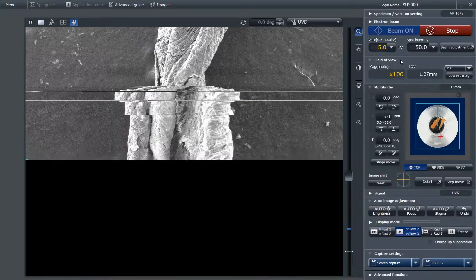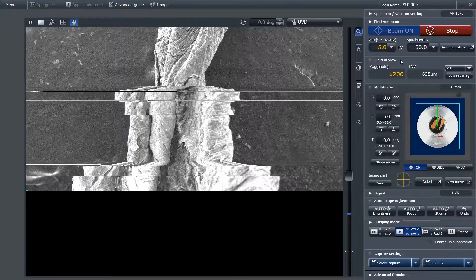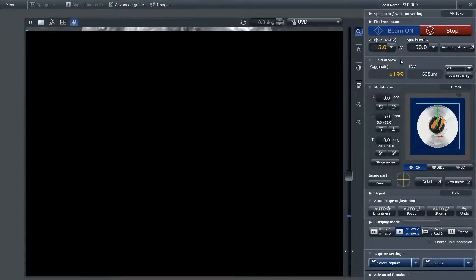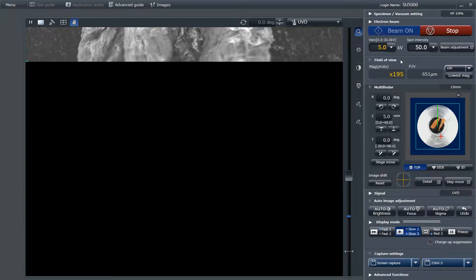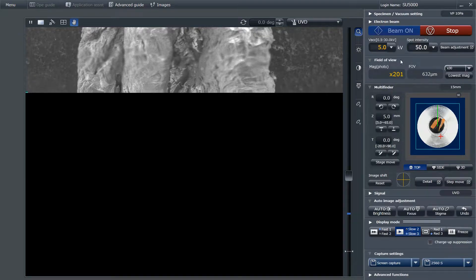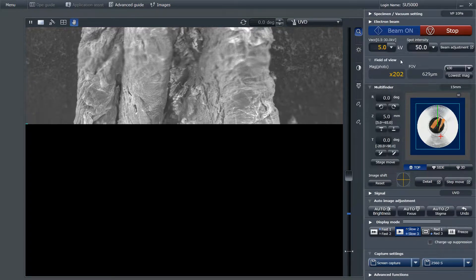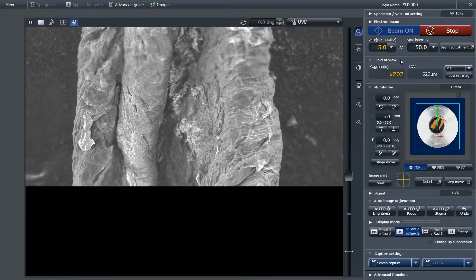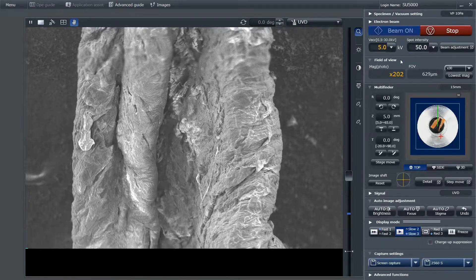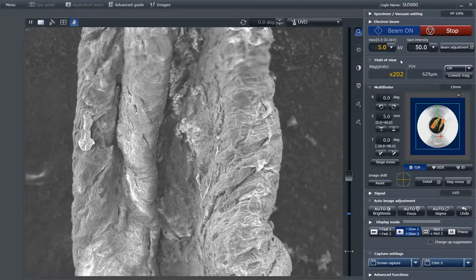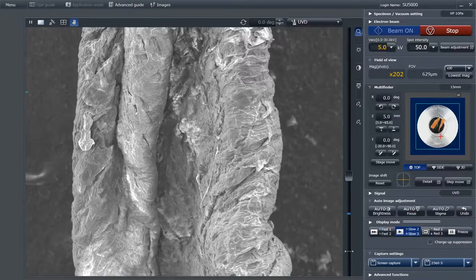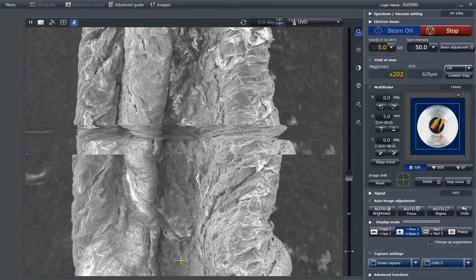I've identified the end of the carrot, and I'm about to observe what differences there are, if any, and also change the vacuum mode so that I can take a live video rather than scanning the sample.